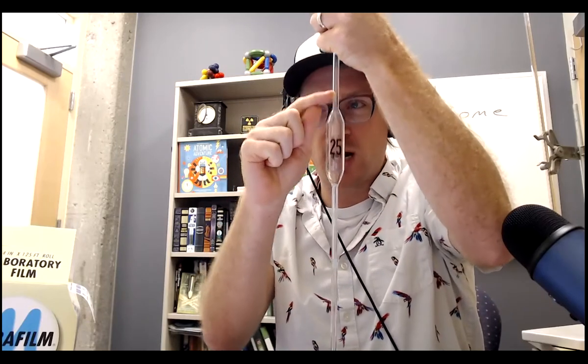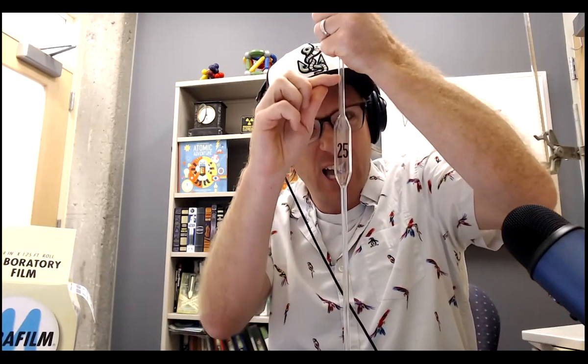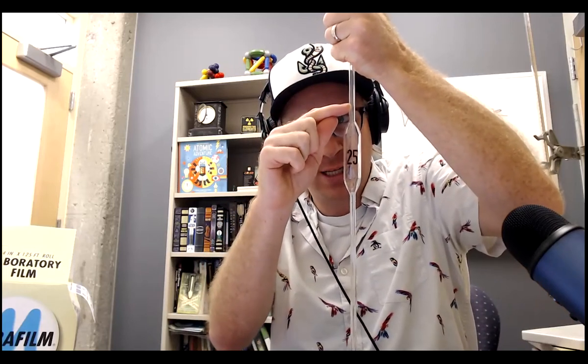What I like to do is hold it over the beaker that I'm measuring in. I need to get the meniscus right on this line. And what I do is I kind of twist it. I'm kind of overexaggerating. I don't twist it like this, but you twist it. And when you're slowly twisting it, it will dial down the liquid straight to the line.